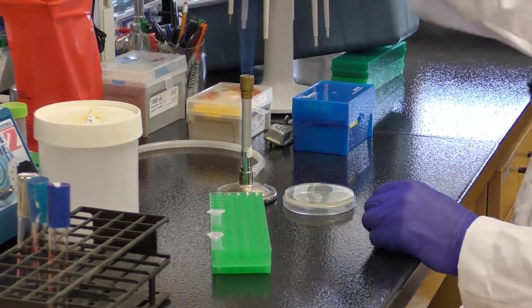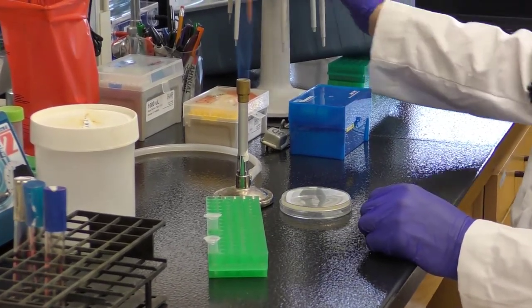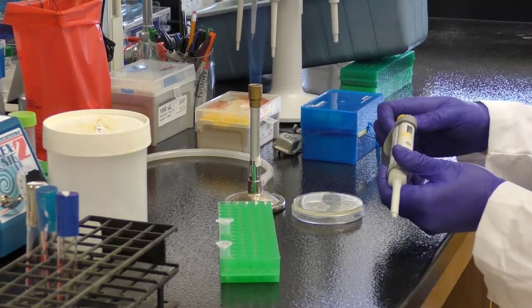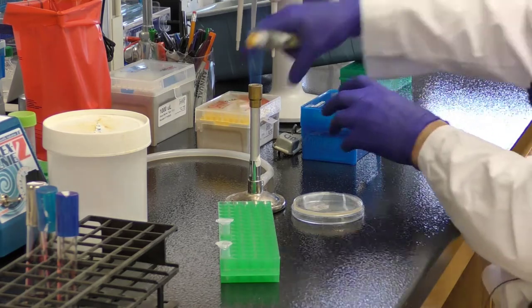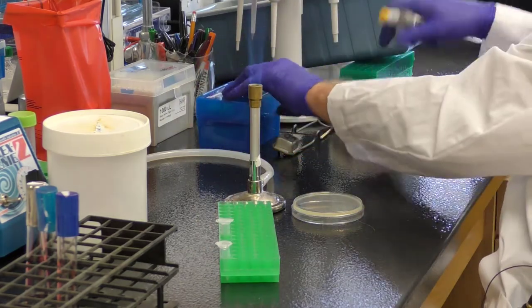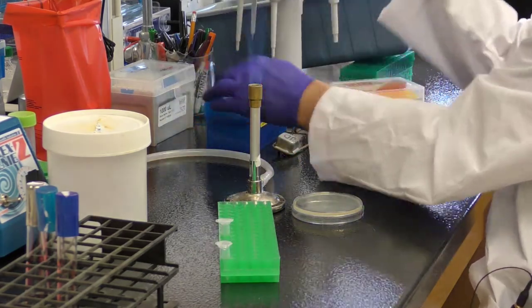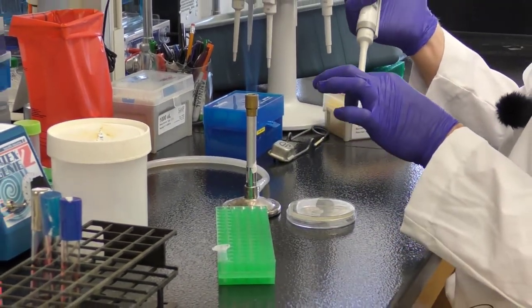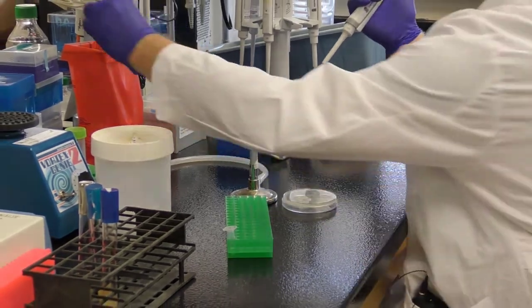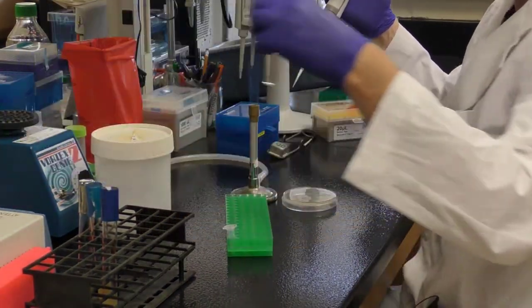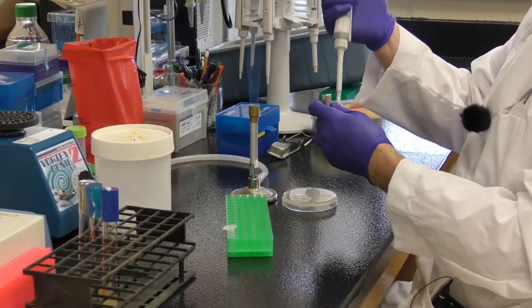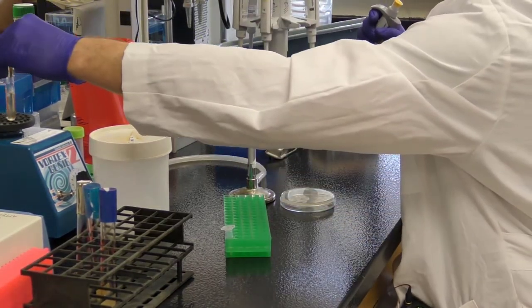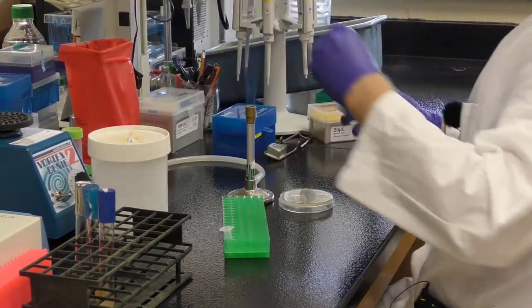Then when that's ready, I will take my pipette, set it to the required volume, aspirate the entire volume of reaction, and add that to our four mils of molten top agar. Vortex on low speed, again trying not to introduce too many bubbles.